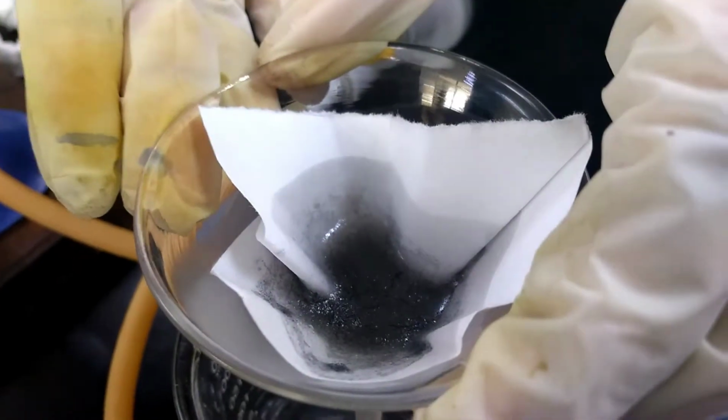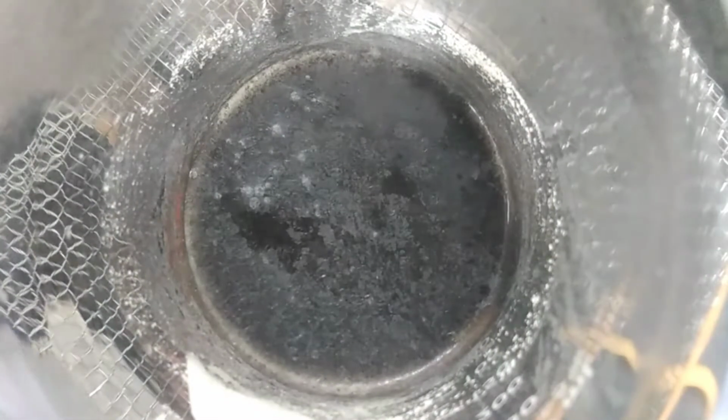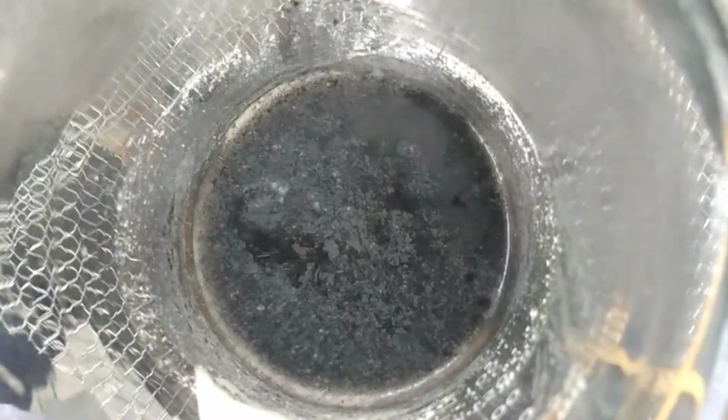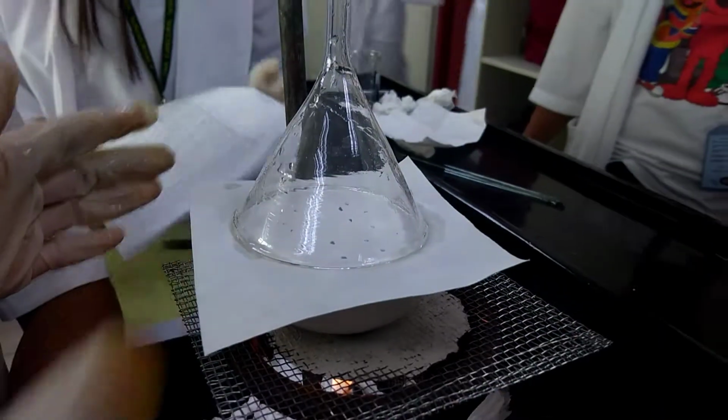Step 5. Allow the mixture to cool by placing the beaker in a pan with tap water bath. Record your observations from each step. Here are the procedures for sublimation. Step 1. Grind and mix 1 gram of benzoic acid and 0.5 grams of Na2SO4 in an evaporating dish. Step 2. Cover the evaporating dish with a perforated filter paper.